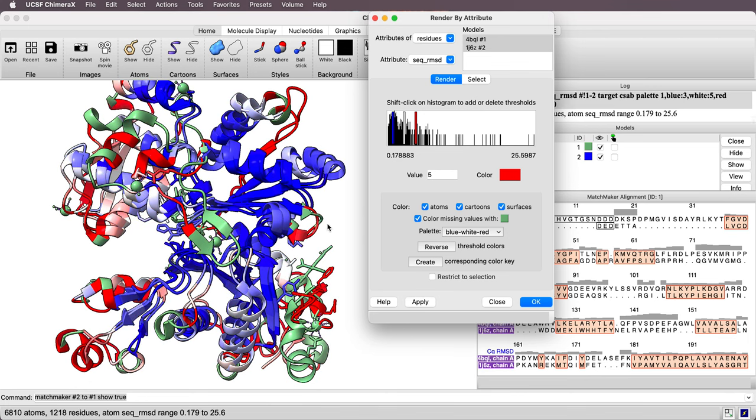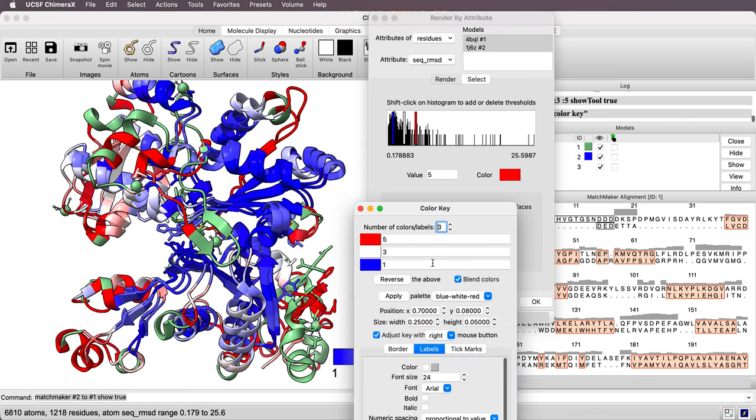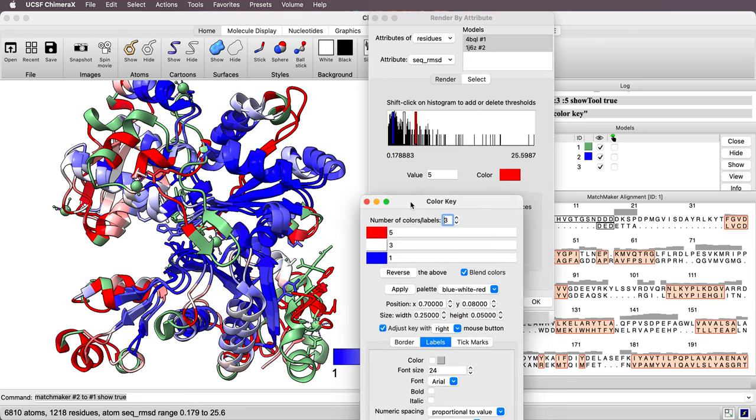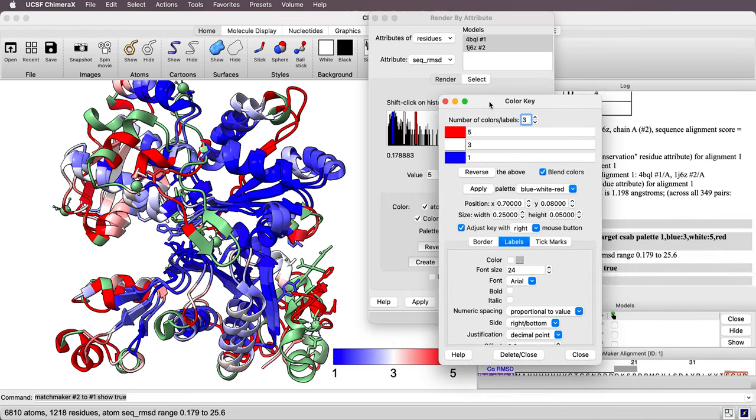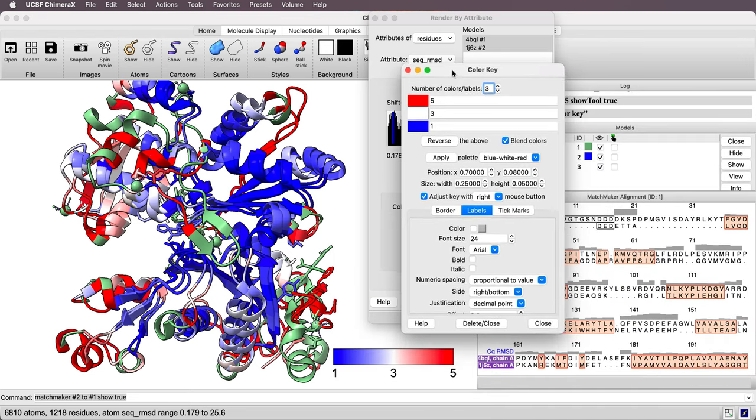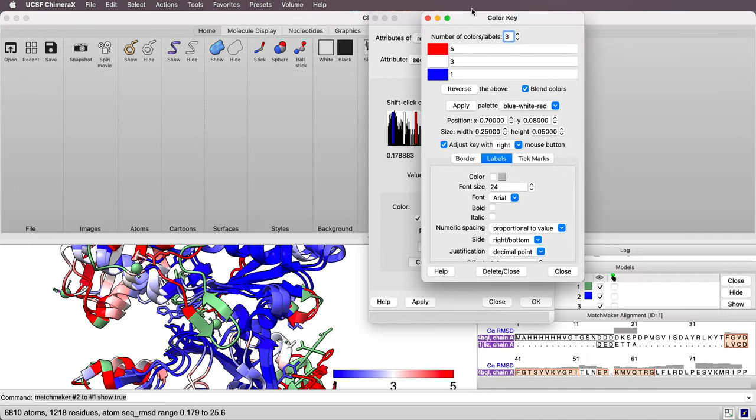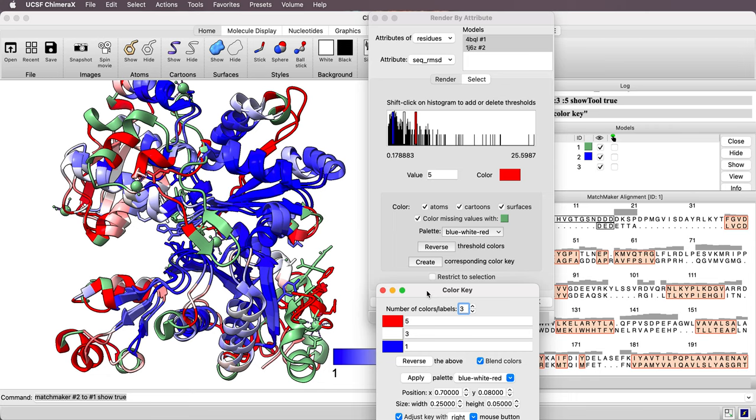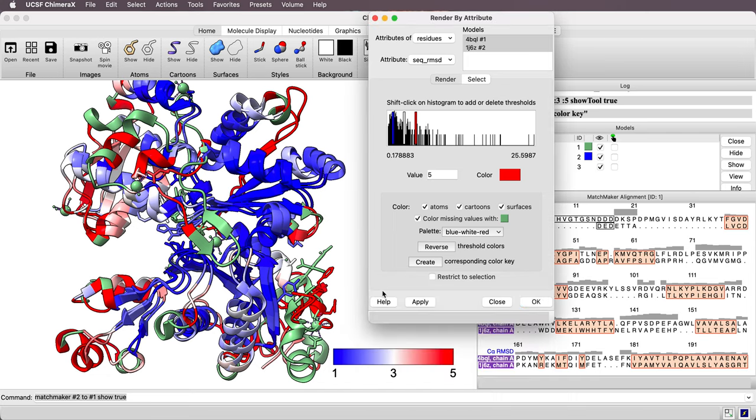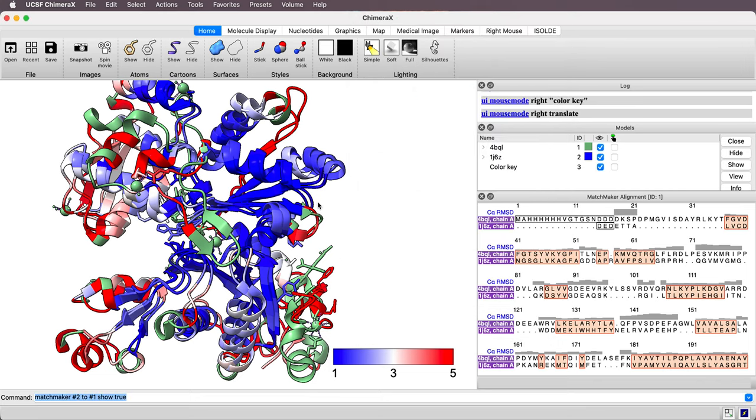I could also make a color key. There's this create corresponding color key button that I'll press. It brings up a panel. It made the color key and it brought up this panel that allows me to adjust the options, how big the color key is. I'm not going to change it at all. And I'm going to hide this render by attribute.